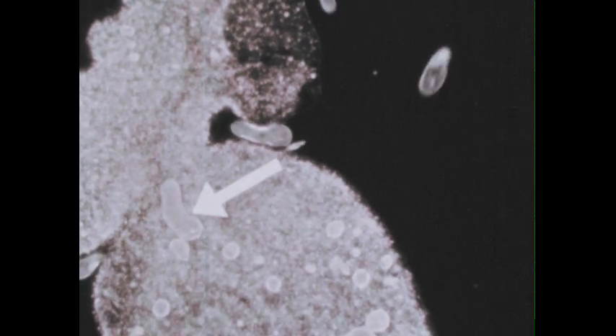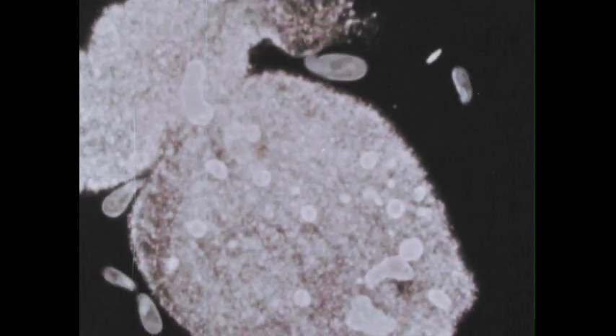With this dark background, you see an amoeba, and paramecium and euglena also, and you can compare their size. Watch how it flows down as if to catch the paramecium in these indentations. Do you think it ever catches one? What's inside here? It's a paramecium, but the pale color is because it has been partly digested. So you see that this flowing of the amoeba can also be used to surround and capture food, which is later digested inside. Before we leave the microscope, let's look at that fascinating flowing of the cell again — that movement so characteristic of amoeba.